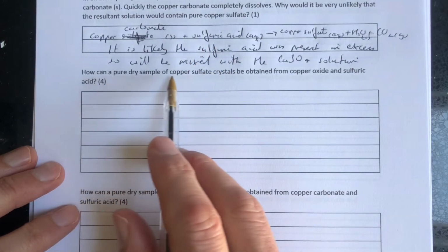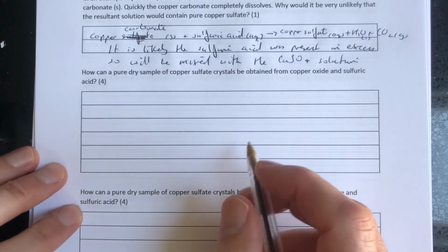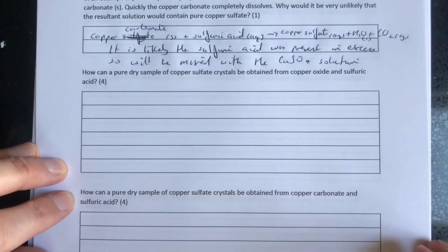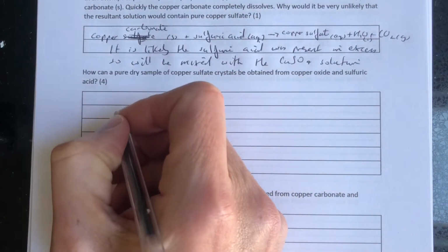How can a pure dry sample of copper sulfate crystals be obtained from copper oxide and sulfuric acid? This is one of our Year 10 core practicals. It gets tested an awful lot, so it's certainly a procedure you need to know.